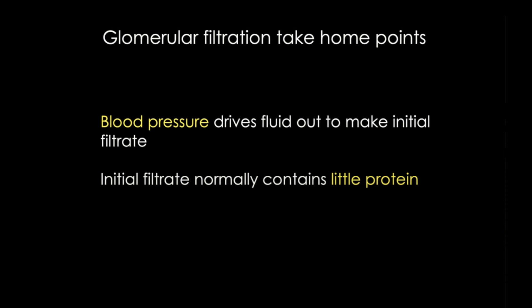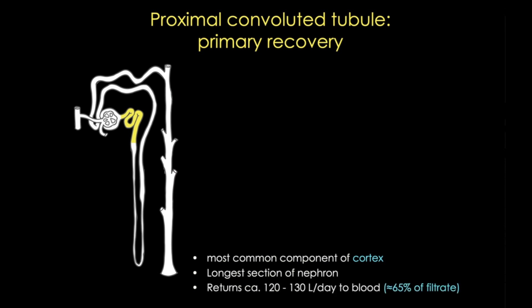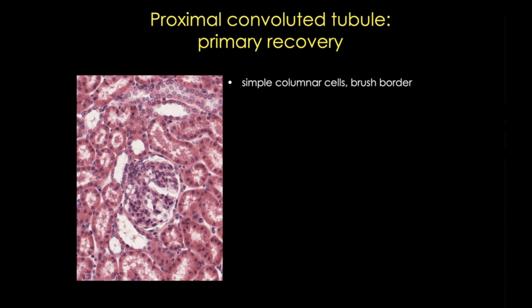Now we're going to travel with the filtrate to the next part of the nephron, the proximal tubule. This part of the tubule resides primarily in the cortex and has a major role in returning fluid to the blood, recovering up to 65% of the filtrate. In sections of cortex, you can see proximal convoluted tubules adjacent to each renal corpuscle. These tubules have a very characteristic look: they consist of simple columnar cells that form a brush border. Compared to other tubules, you can see very few nuclei in a proximal convoluted tubule section, and the lumen appears fuzzy — what I call full of cotton candy — due to the very long microvilli that form the brush border.